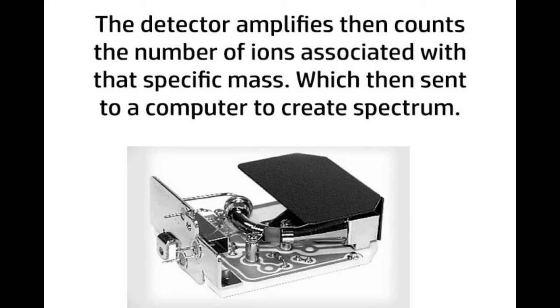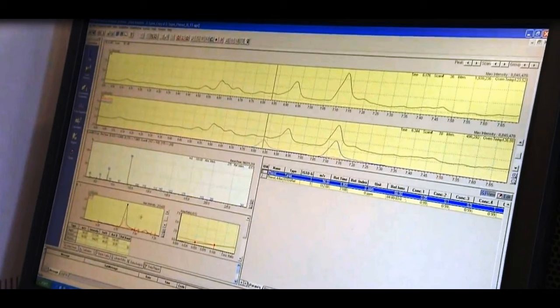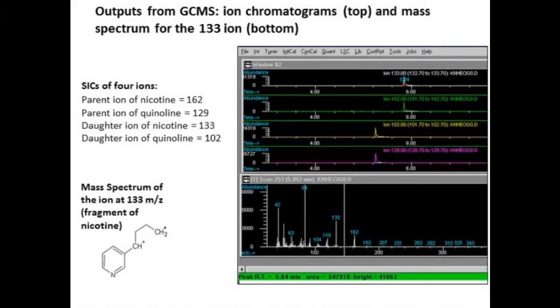The final steps of the process involve ion detection and analysis, with the fragmented ions appearing as a function of their m/z ratios. Peak areas, meanwhile, are proportional to the quantity of the corresponding compound.